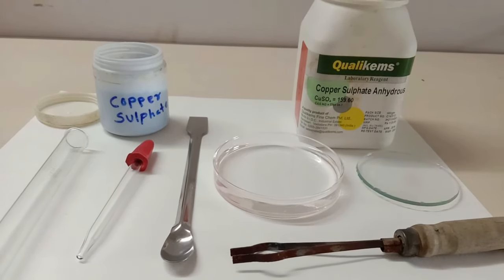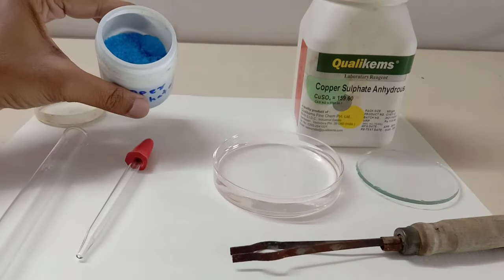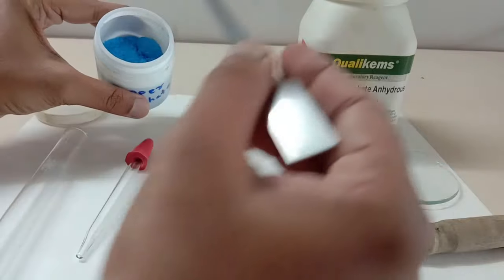So now let's take some of the hydrated blue colored copper sulfate salt in a test tube and let's heat it over the Bunsen burner.